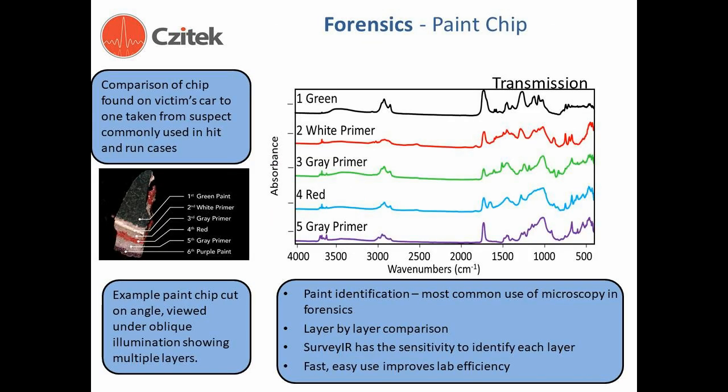The analysis of paint chips left on surfaces in hit-and-run accidents provides important physical evidence that can link a suspect to a crime scene. Automobile paints can be complex, consisting of numerous stratified layers. In this example, the paint chip exhibited 6 distinct layers, as shown at left, observed under oblique illumination. Material from each of these layers was isolated, and the infrared spectrum recorded, shown right.